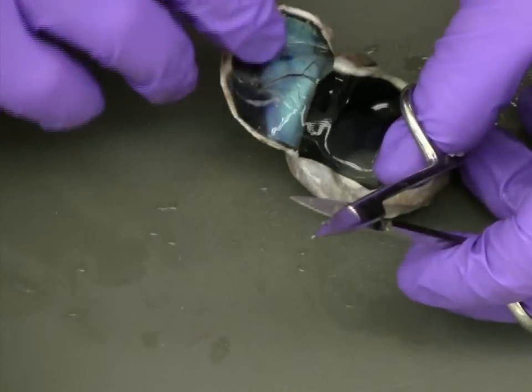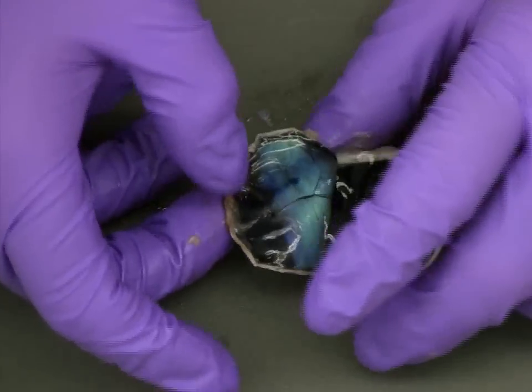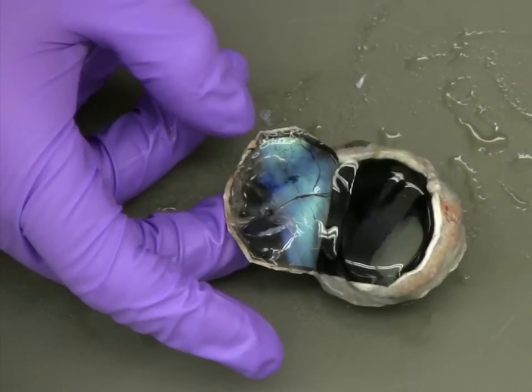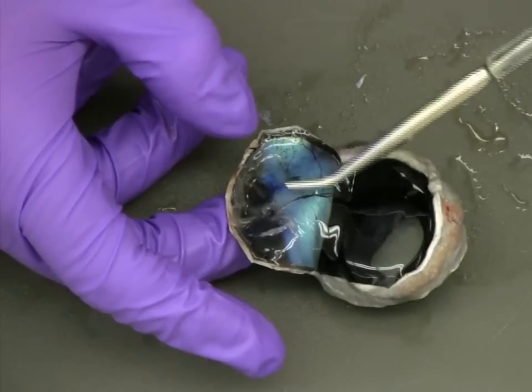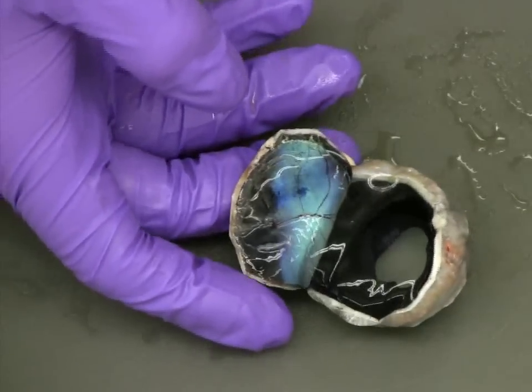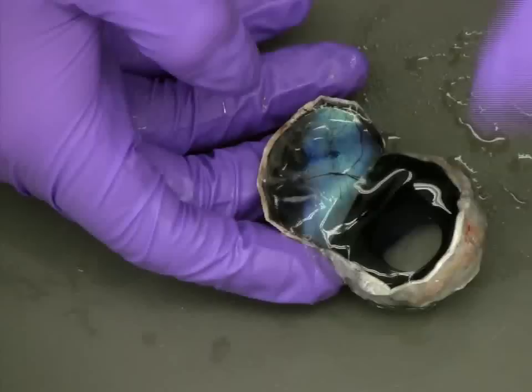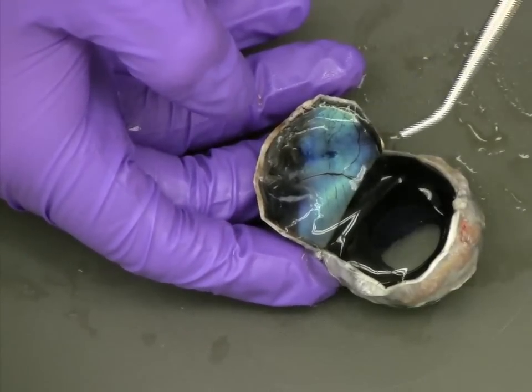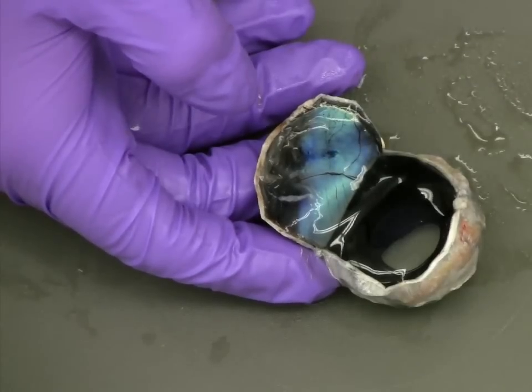Stop cutting before going completely around the eye and fold back the sclera to expose the vitreous humor and the retina. Here we can see that the vitreous humor is completely clear and the retina is also almost completely translucent. In a fresh eye, the retina can be easily damaged during dissection, so now is a good time to note the blood vessel structure of the retina.